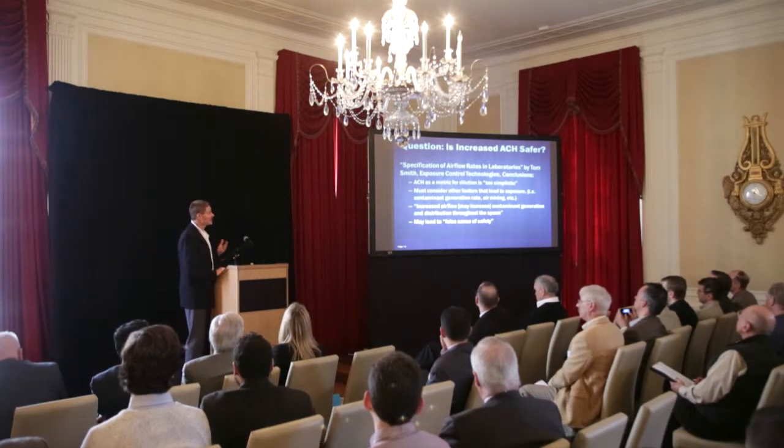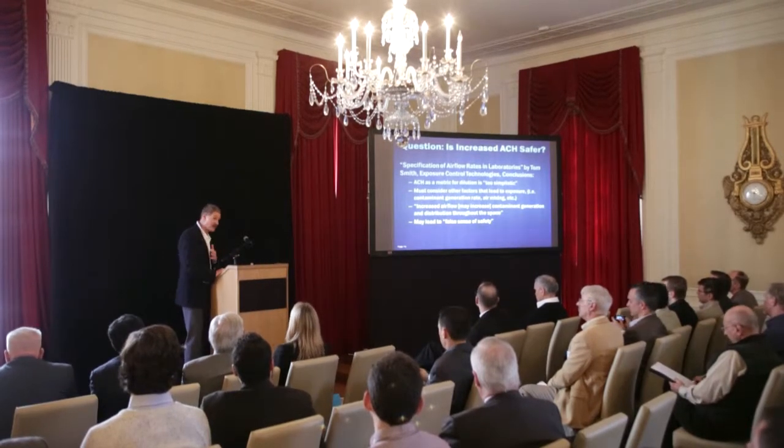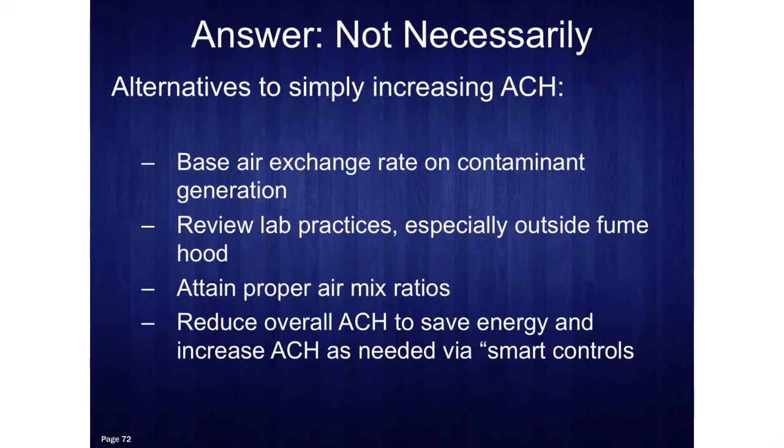Just paying attention to air changes could lead us to a false sense of safety. So over those years, the answer that we came to is that increased air changes are not necessarily safer. So we're trying to base our air exchange rate on contaminant generation. We review lab practices. As I mentioned, we're working hard for good air mixing in our labs.